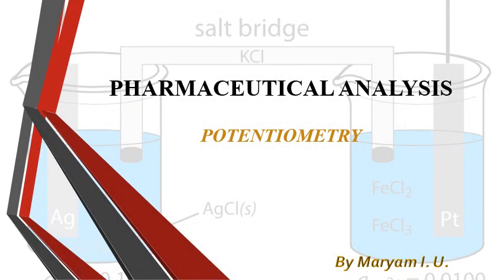Welcome everyone to today's lecture on potentiometry, a key technique in pharmaceutical analysis. This method allows us to determine the concentration of a solute in a solution by measuring the potential difference between two electrodes. I will be guiding you through the principle, equipment, and application of potentiometry.